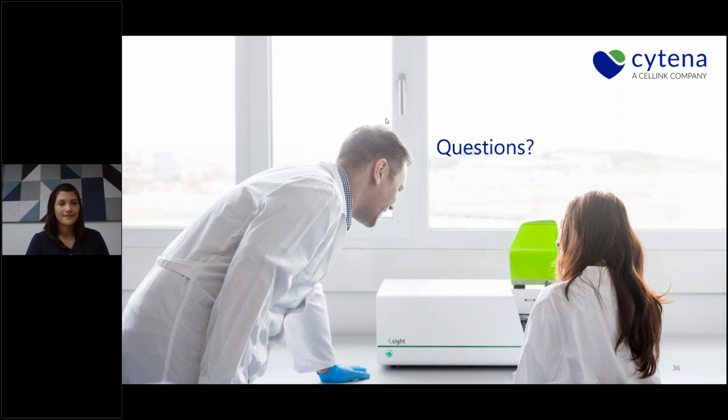Another question: do you see problems with cell sedimentation, or how do you make sure the cell concentration stays constant? Also a good question. We have an agitation adapter to which a pipette tip is mounted, and the pipette tip is put in the cartridge. So it ensures mixing of your samples, and no cell sedimentation is happening in the cartridge.